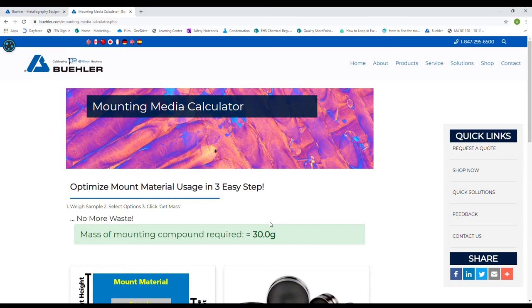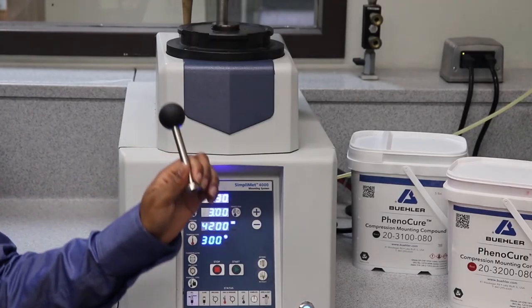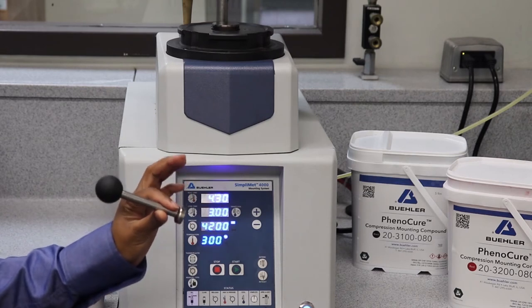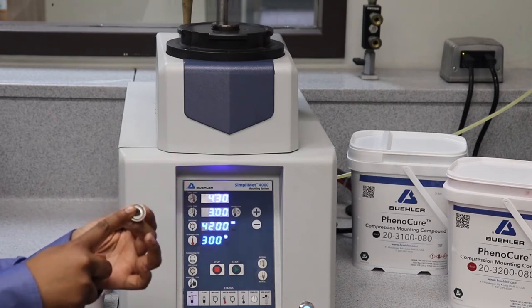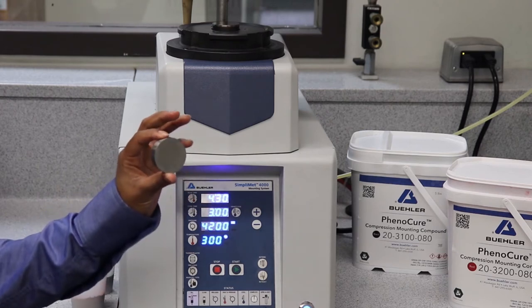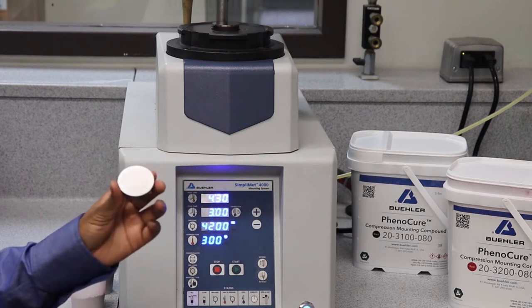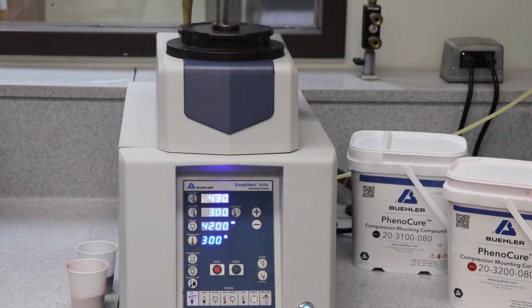Now let's get started mounting the samples. These are the two tools you're going to need. This one is a spacer replacer - it's a bar with a magnet at the end. And then this is the spacer itself. This is going to create a fake lower ram that you're going to put the second sample on top of.